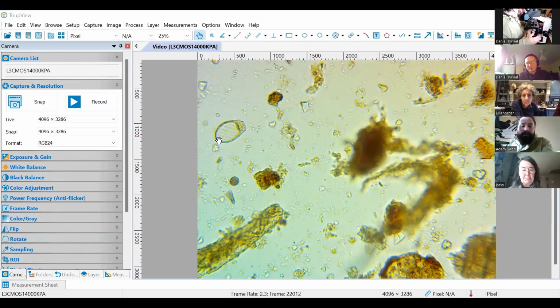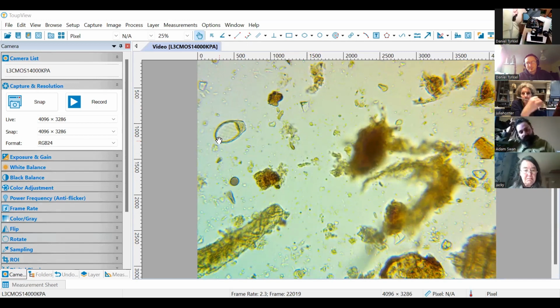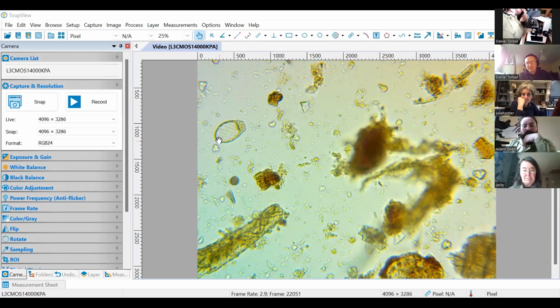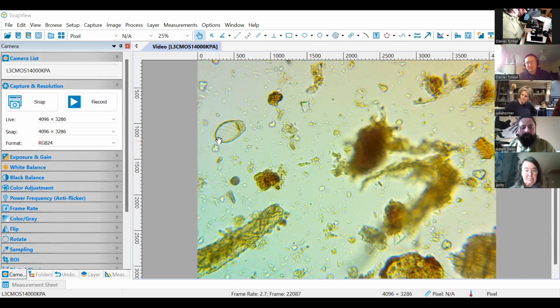So another thing we're looking to count is another thing that eats bacteria and secretes plant available nutrition. It represents our fertilizer liberation powers in the soil. So our mineralization rate could be linked to the population of the things living within the substrate.